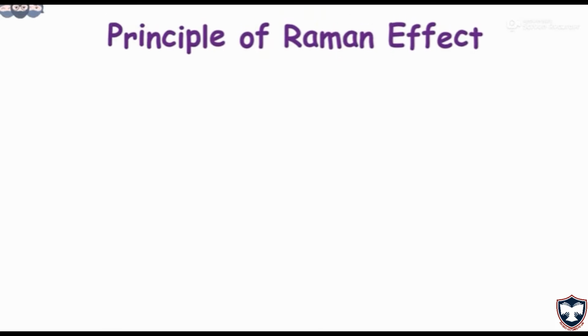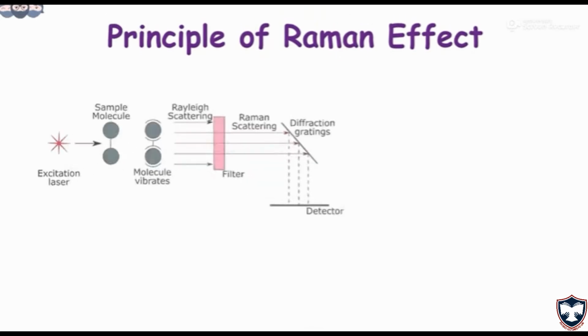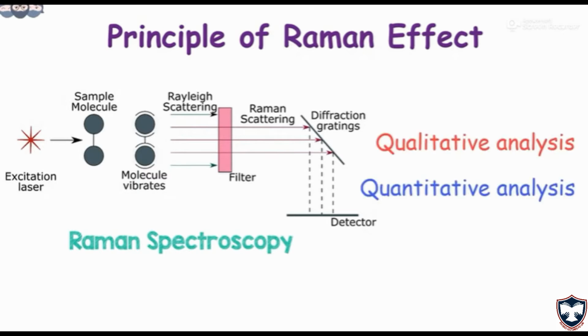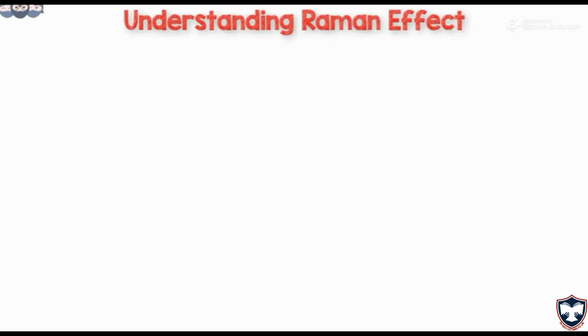In this video, we will discuss the principle of Raman effect and understand how it can be used in Raman spectroscopy to perform analysis on a given sample. Let us first understand the Raman effect.